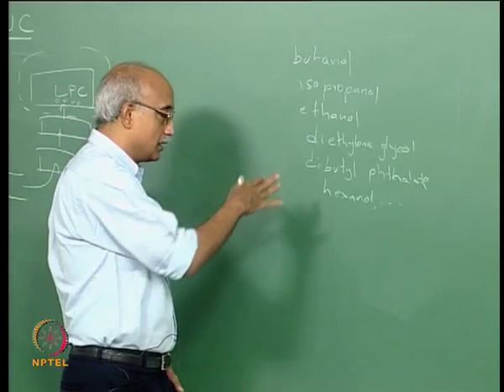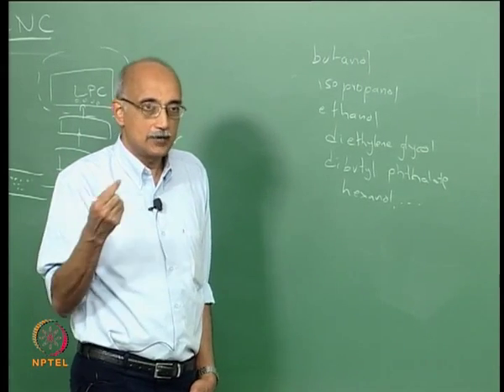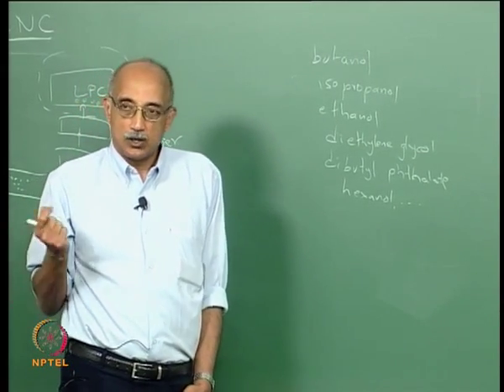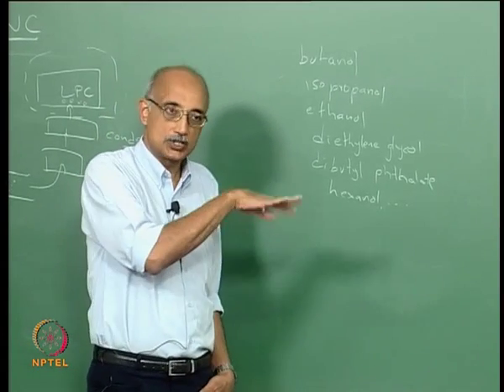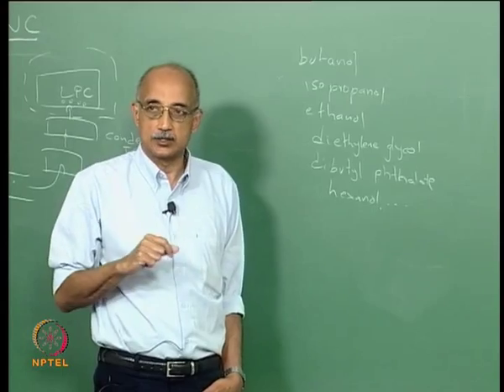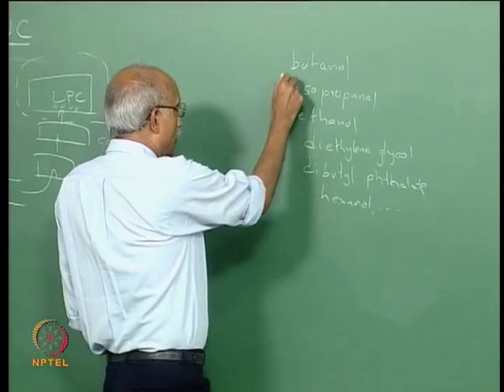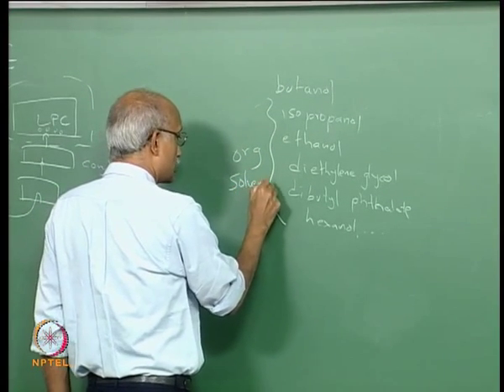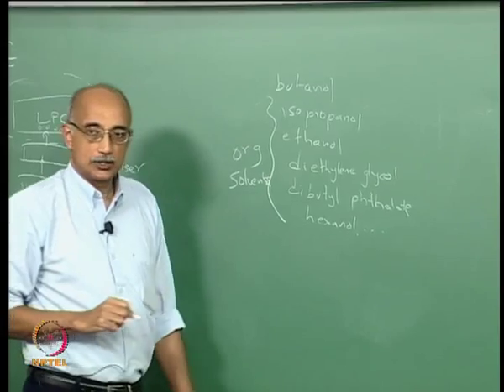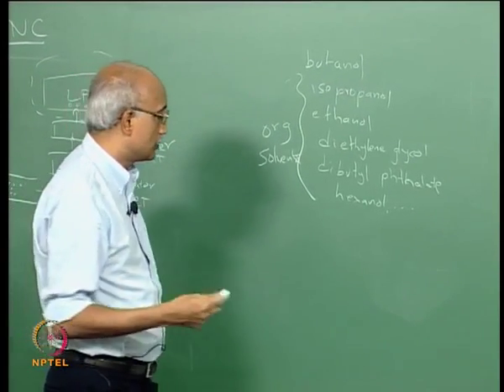So these are materials that can be easily re-evaporated. You can simply take the temperature high and you can essentially recover the virgin particles, or worst case you can use another solvent to essentially remove these condensed layers on the particle. So that is one of the requirements. Now, these are the organic solvents that are typically used in a condensation nuclei counter or condensation particle counter. But there are alternative fluids you can use also.